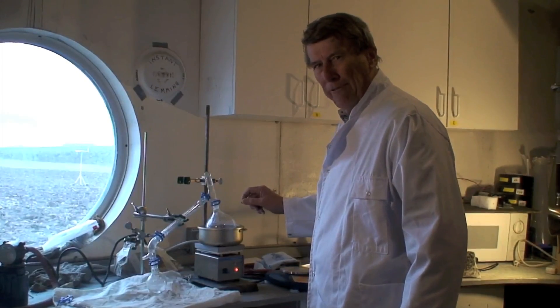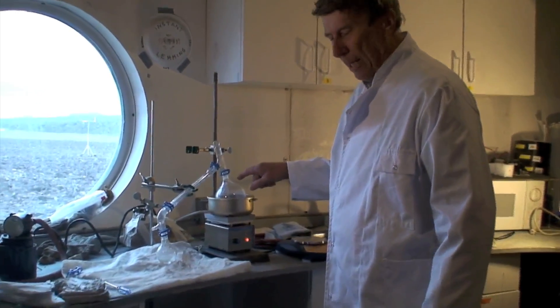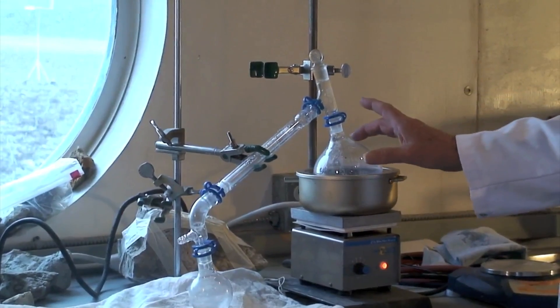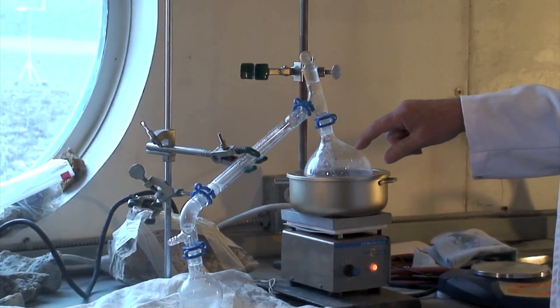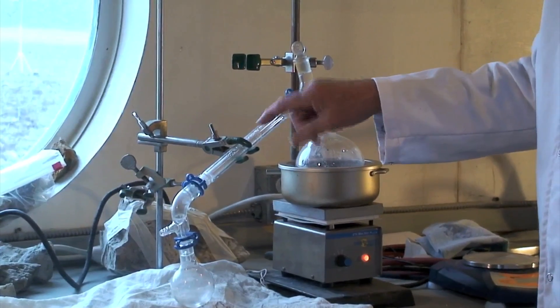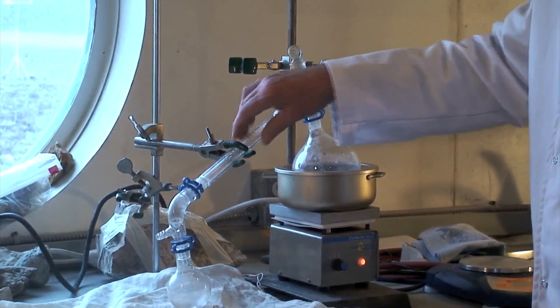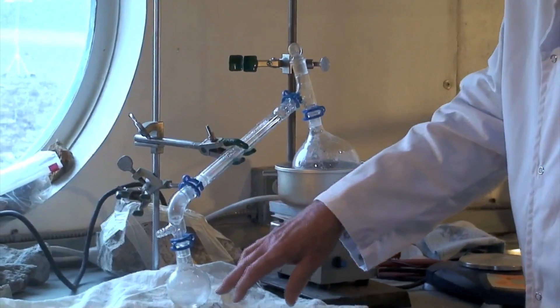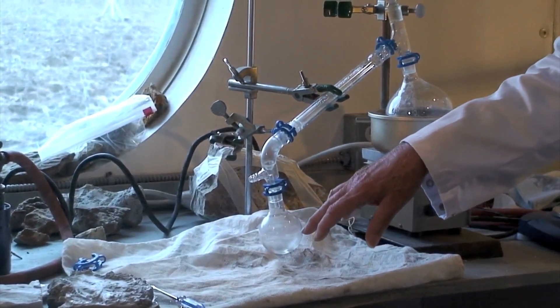Now we are basically 15 minutes later, and you will notice that in 15 minutes we already have water being driven off the gypsum by the heat. The water vapor then comes up into the tube. We will look at a close-up in a minute to see where the water is condensing. This is a tube inside of a tube — cool air here, hot air here — which is making the water condense and collect at the bottom of the tube.